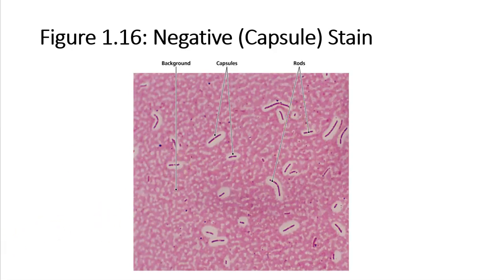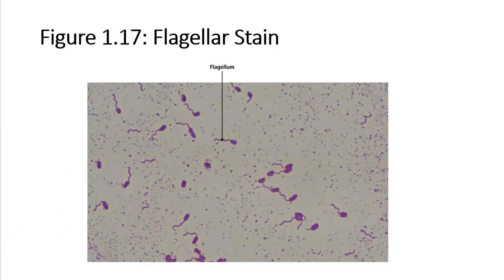All right. Flagella stain. Maybe we want to look at the flagella. Whoop, there we go. There's the flagella. So hopefully this gives you a little introduction to microscopy and staining. There are going to be some YouTube videos that I'm going to want you to watch. And I'll also be going through some of these other ones. But hopefully you will have a little bit better feel. And this is about as best as I can do to get you into the laboratory. Okay.